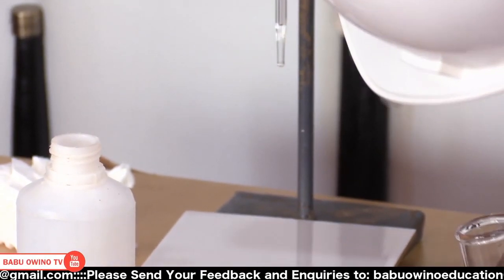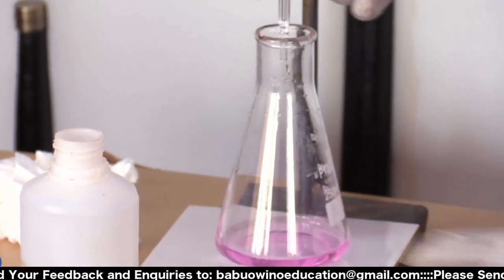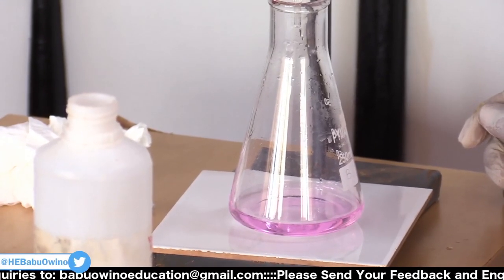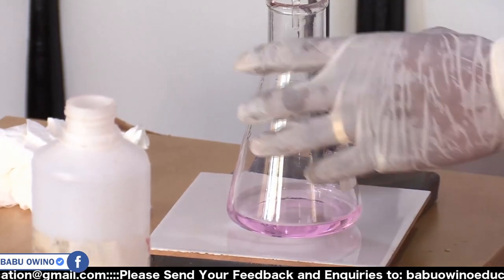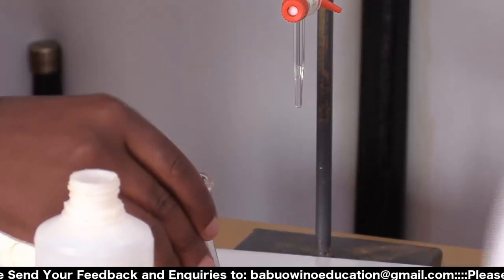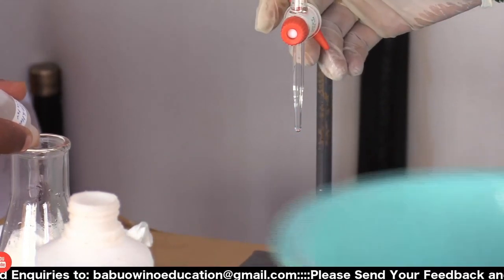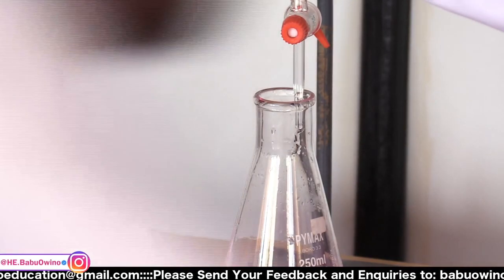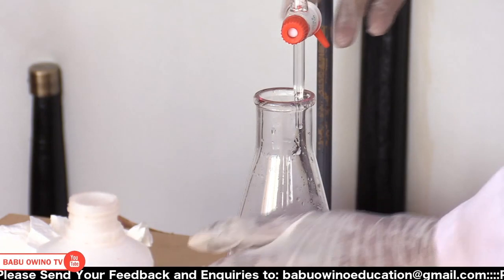So the first titer, I'm saying it was 6. This is the volume. That is the final reading. This is the initial reading. This is the volume used in centimeters cubed. No, I did not release it. So I release faster. The first value changes because we did not release it. It changes to 12.8. Fine. Let's move on.